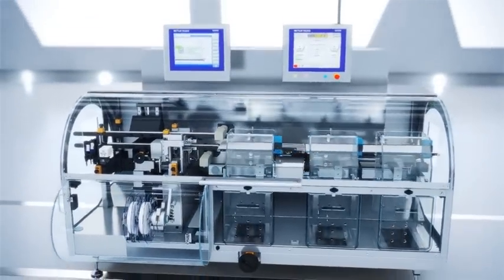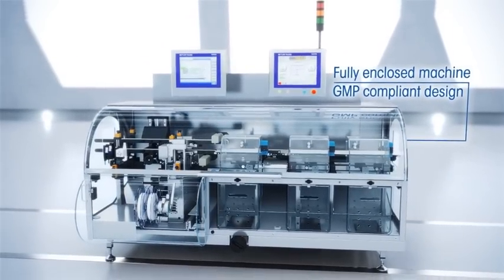The machine has an all-round safety enclosure and fully complies with good manufacturing practices.